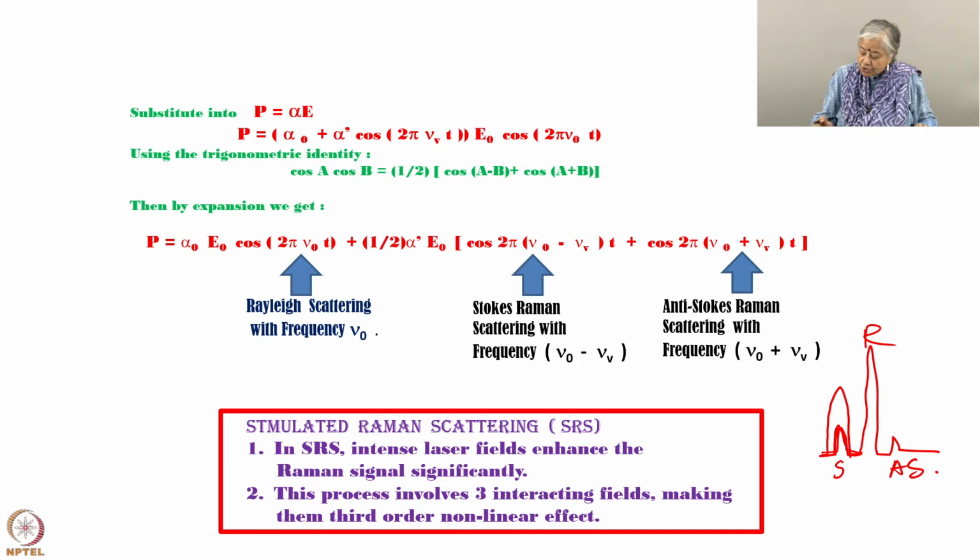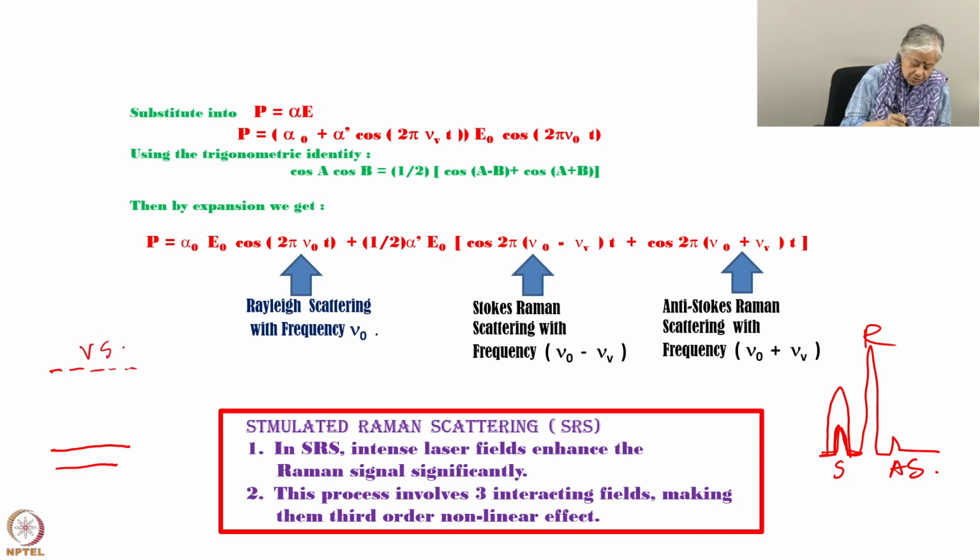Okay. So, stimulated Raman scattering is not very much different from this, only thing is you have this bottom state and this is the vibrational state and this is the virtual state. So, what we have done till now is put a laser there and the same thing comes down here with a shifted wavelength.